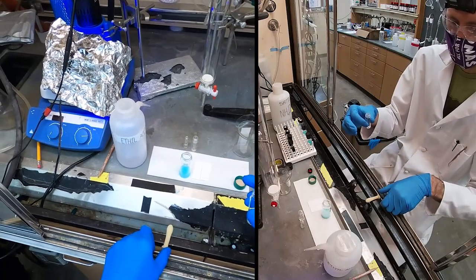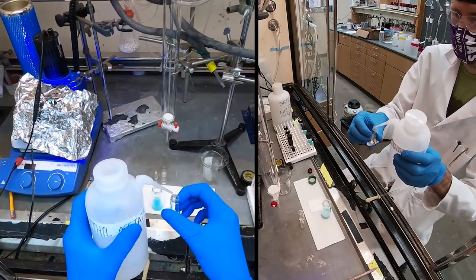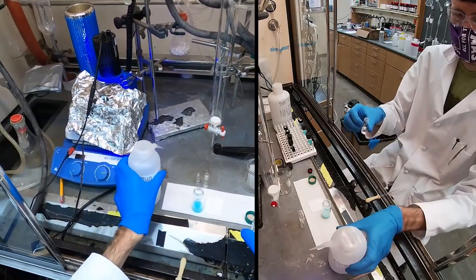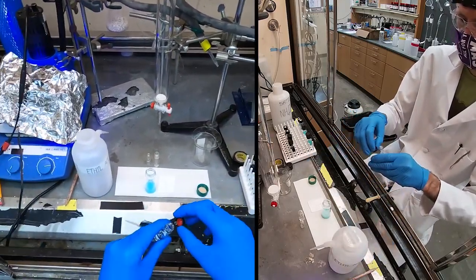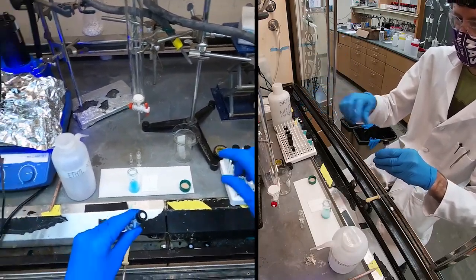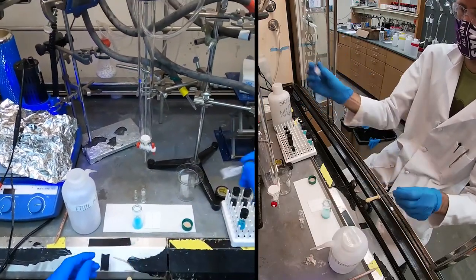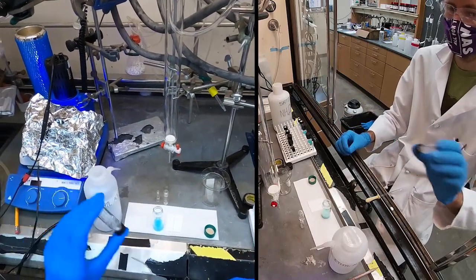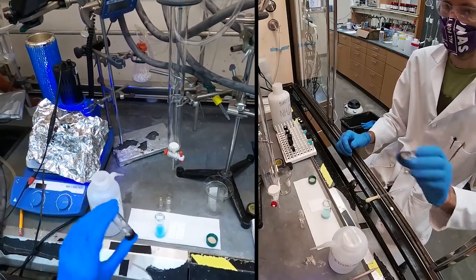And when I run this through the flash column, all of those solids and all of that leftover copper and all those salt byproducts that I'm getting rid of when I do an aqueous workup, they're going to get caught in the silica. And so they're not going to pose any problems or any issues for our workup.